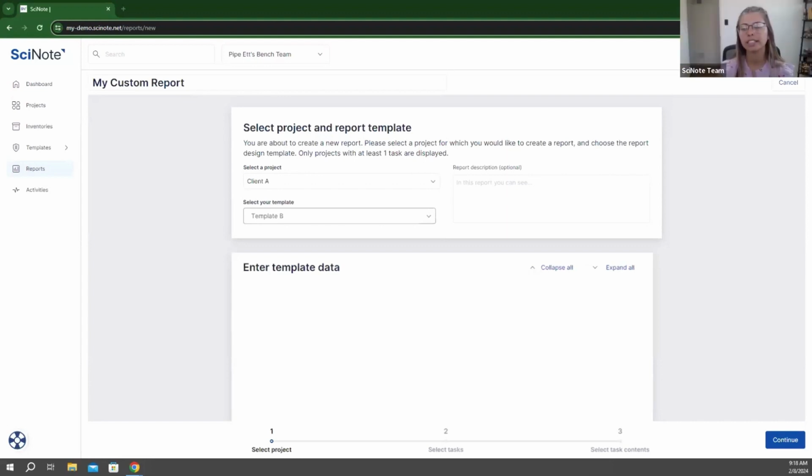Especially depending on what your plan is, if you are on essential or validated, it's something I would like to bring back to our technical team, because if you are following a certain compliance and then we're changing the dates of projects, it might put you out of compliance. And we don't want that to happen. So that's definitely a little trickier area to navigate, but I'm not saying it's off the table. We'll talk with our technical team, and we can get back to you on that.